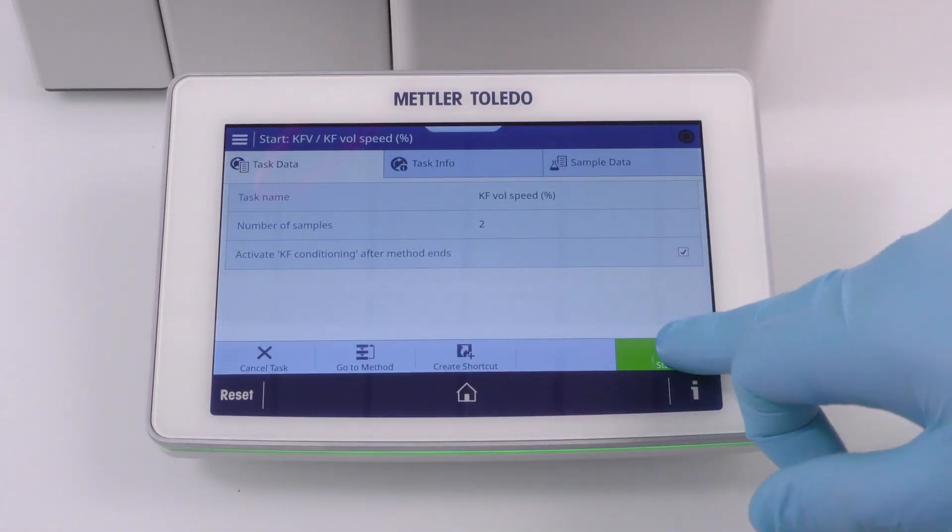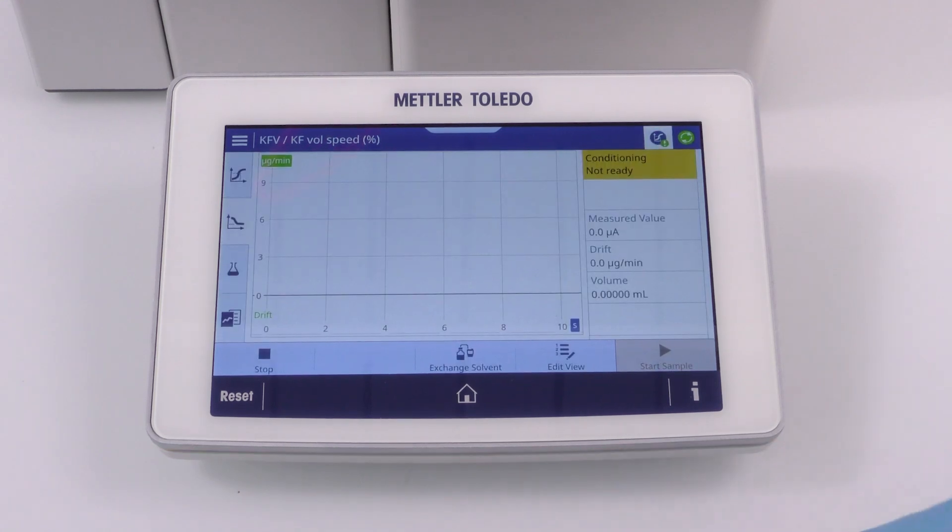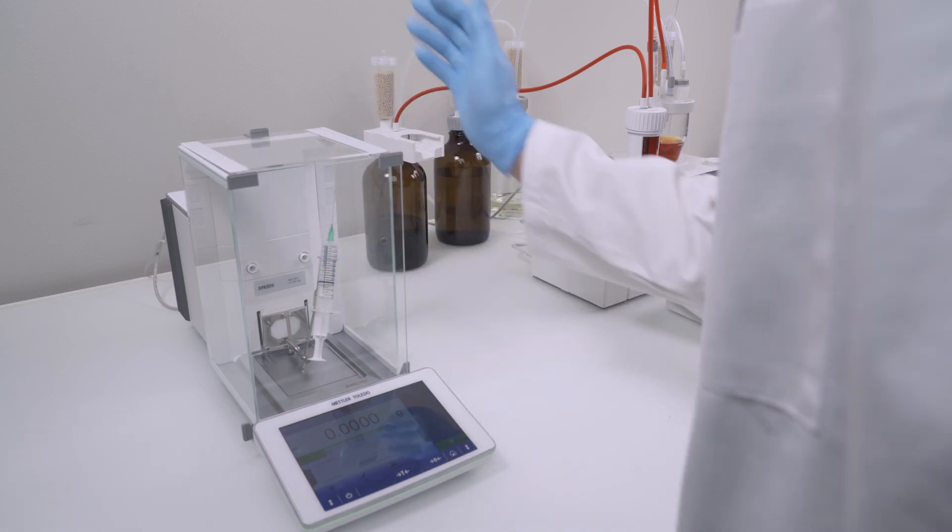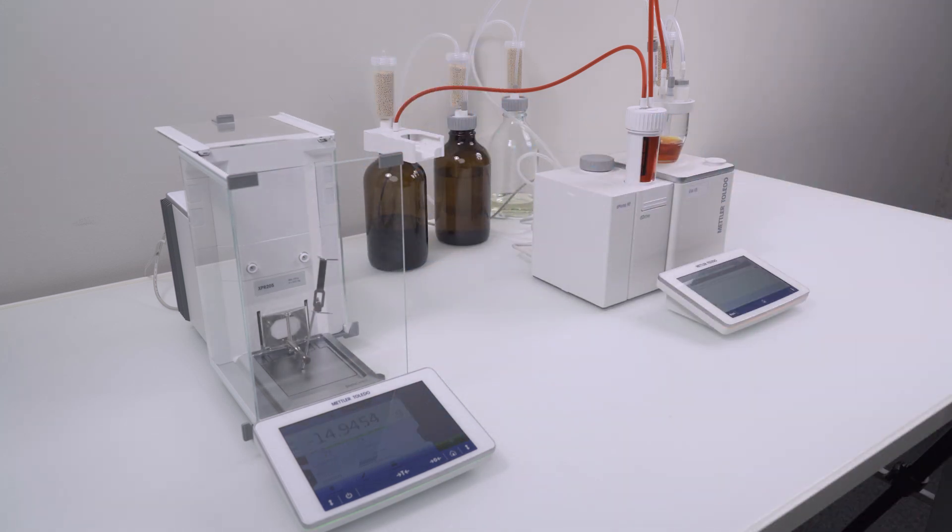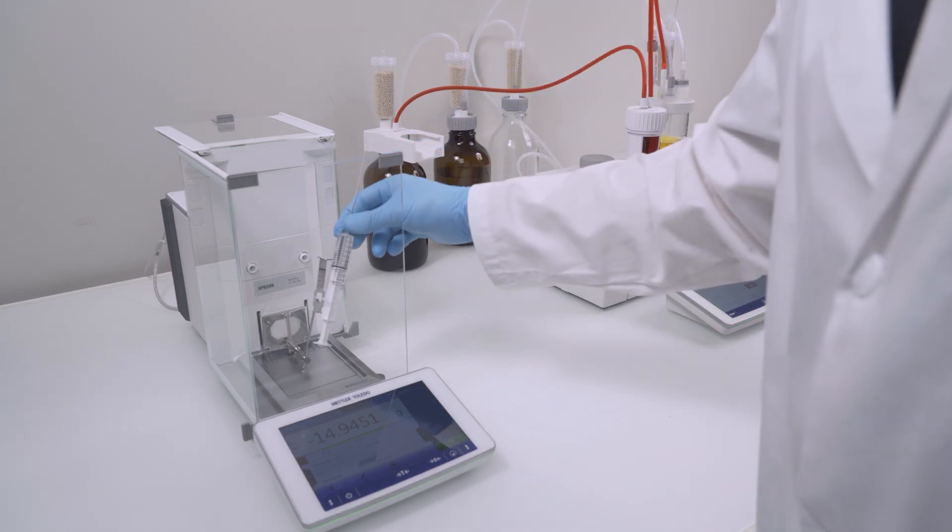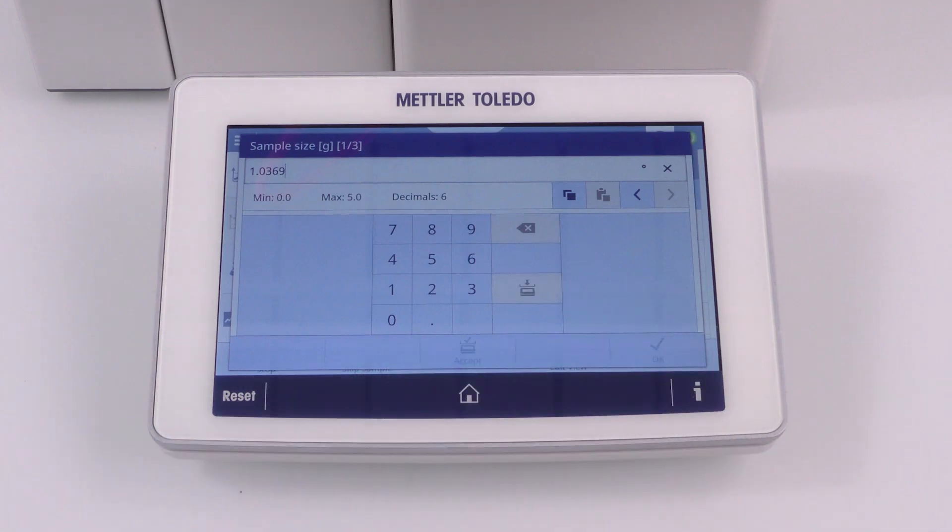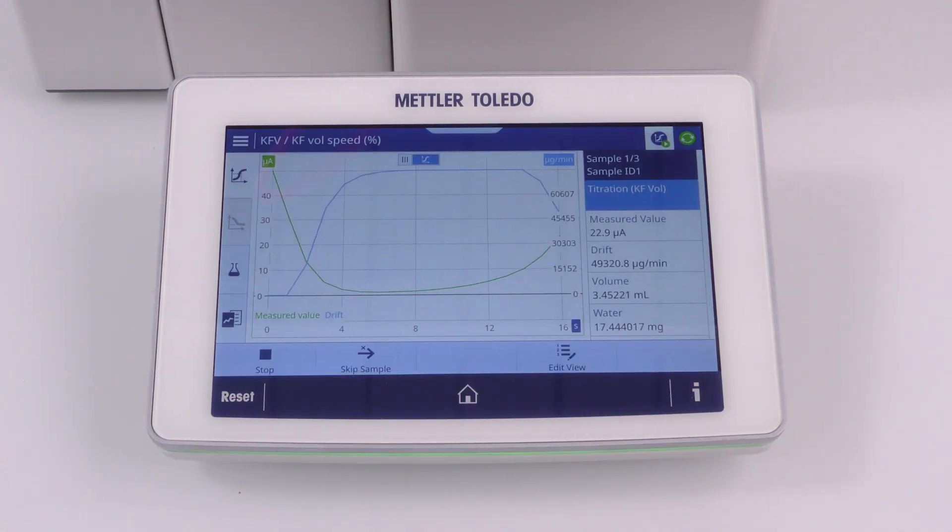Start the task to measure the industrial alcohol sample from the shortcut and as soon as the cell is conditioned and ready, add the sample from the pre-tared syringe. Enter the weight and wait for the sample to be finished to run with the next one.